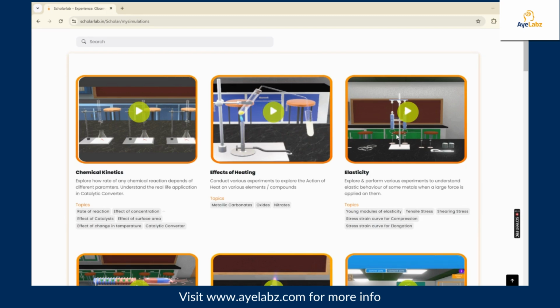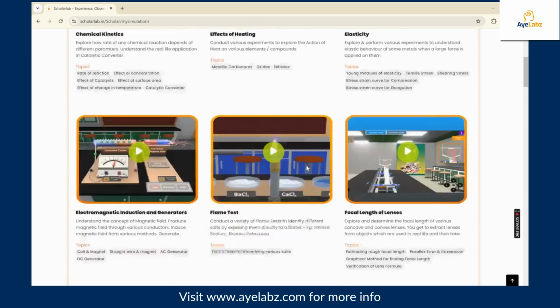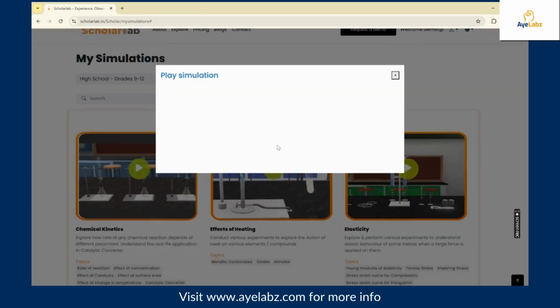This experiment will showcase the vivid and unique colors that various metal salts produce. And in the second part, you will get to test your detective skills by identifying the unknown salt based on the colors they display. So without any further delay, let's get started.